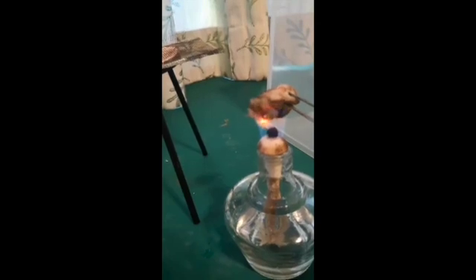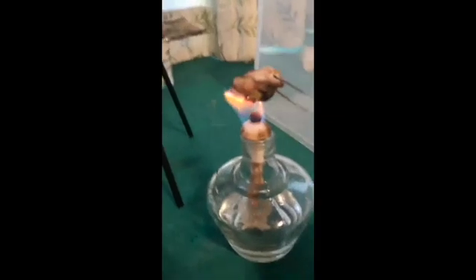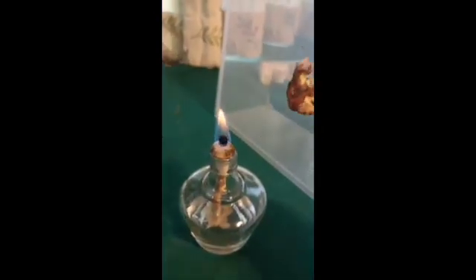Brief safety note. As you can see, the platinum catalyst produced in this way has an extremely high catalytic activity, and could potentially light flammable gases such as butane or hydrogen on fire. Care must be taken when preparing the catalyst.